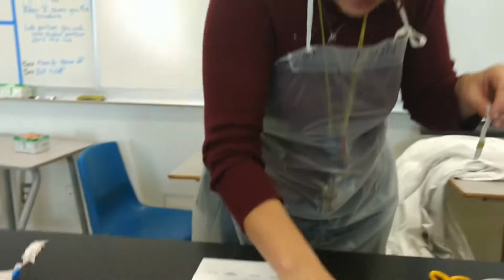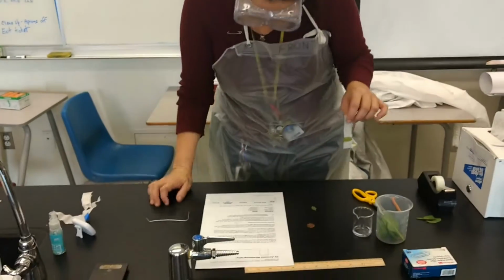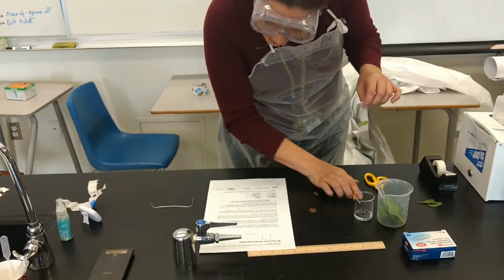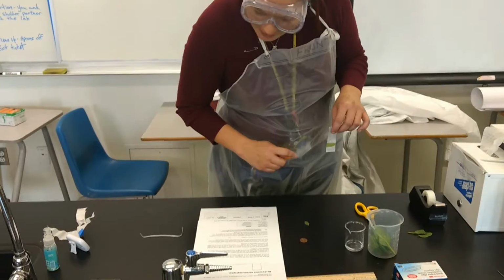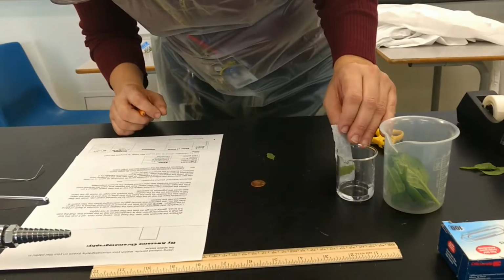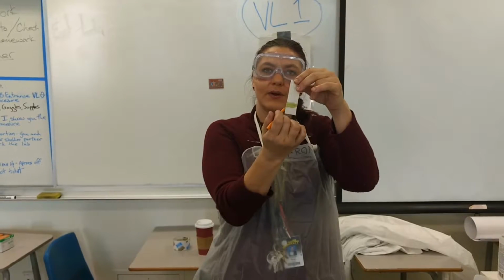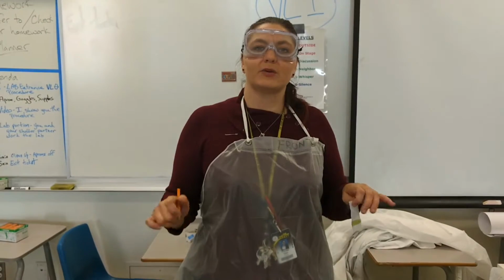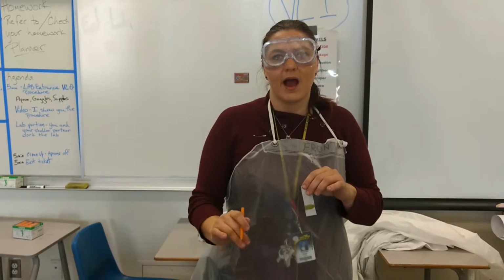Okay, that's a lot more than we actually need, but this is, of course, just a demonstration. Yours is going to look different. So I did that 4 or 5 times. Going to make my check mark on that. Okay, so I've done the isopropyl alcohol for 10 milliliters, not higher. I'm just double checking, because if I get the ink or the liquid into the container, it actually invalidates the experiment. So we need to make sure that the pigment doesn't go below. If it does, we need to restart our paper.